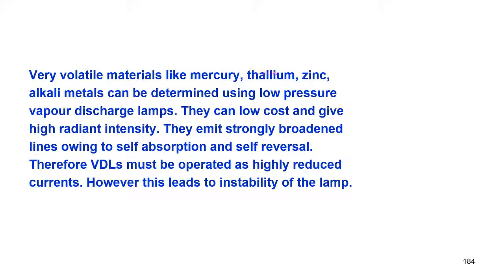Why only these things? Because we do not really create the discharge as in a flame, and we simply use the material as such.